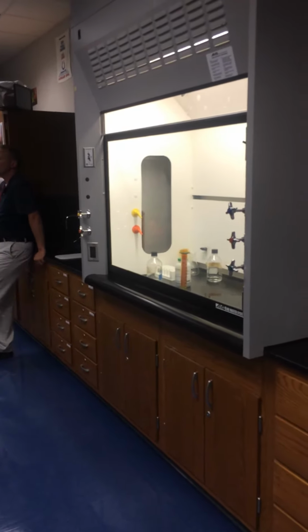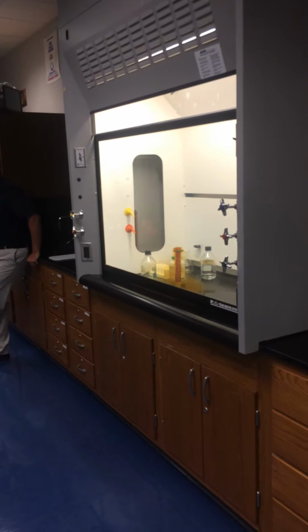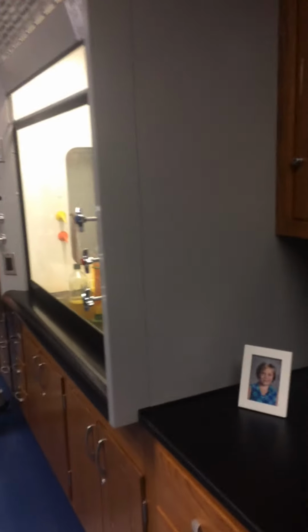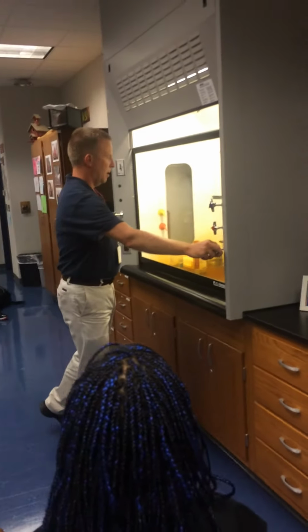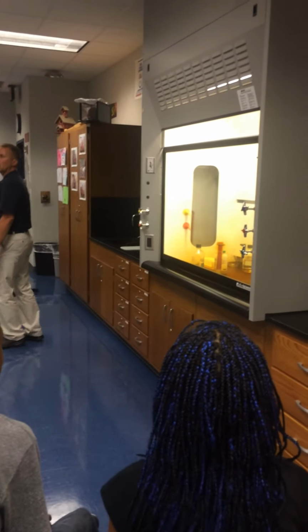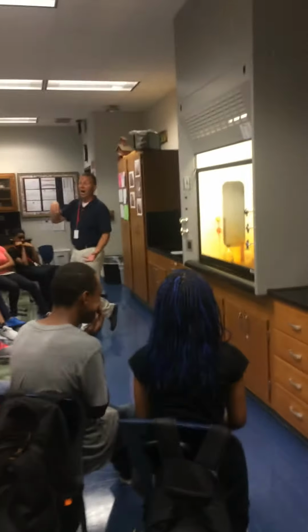What happened to the color of the liquid? Pink. Turned what color? Kind of a green. And now you're seeing that gas come off the top. What color is it? Orange. It's got a little crack at the bottom. It's okay. And one thing I will do is turn on the water here. That liquid, what do you notice with it? It's bubbling, right?